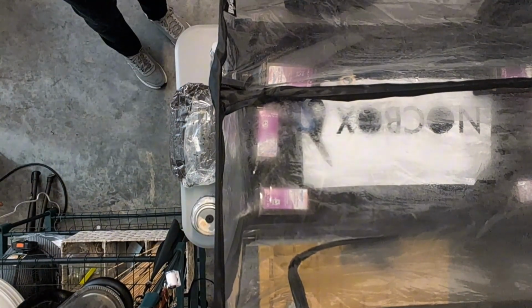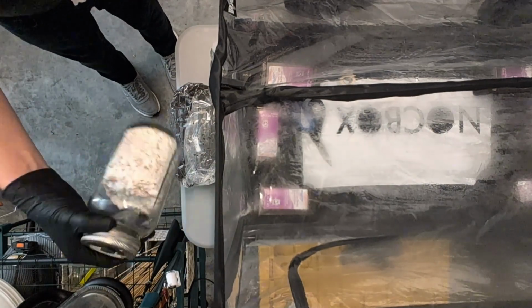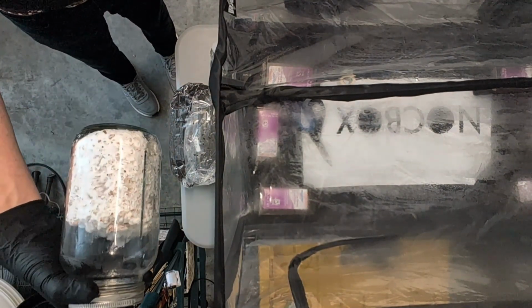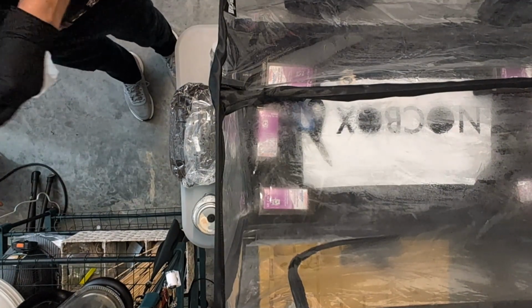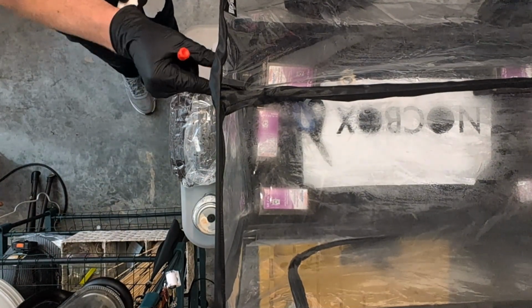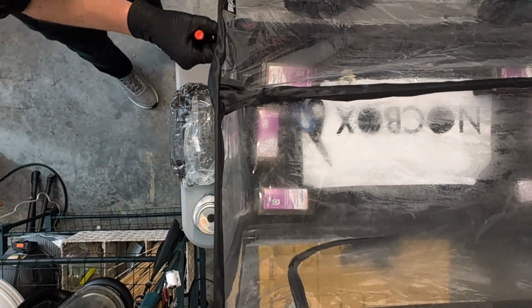I have this little screwdriver here. I'm going to put this in the still air box as well. What I'm going to use this for is to break up the mycelium, the grain, inside of this jar. Usually, I use a wooden spoon, but I got the idea to use this earlier today, and it just seemed like a good idea, so let's find out. Just any kind of metal that you're going to be putting in the plastic still air box, be careful.